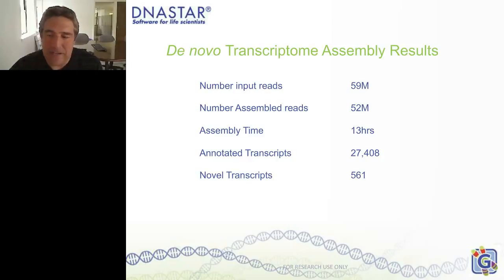that are annotated. And so what that means is those are transcripts that when the algorithm goes through the assembled transcripts and compares them to a database sequence, that it can identify them. And so the database sequence then is the mRNA. It'll automatically link up with the mRNA database at NCBI and scan the assembled transcripts against all the different annotated transcripts and find the strongest hits and say, it looks like this transcript belongs to this gene and it came from this organism. So with the tilapia, most of the assembled transcripts were identified.